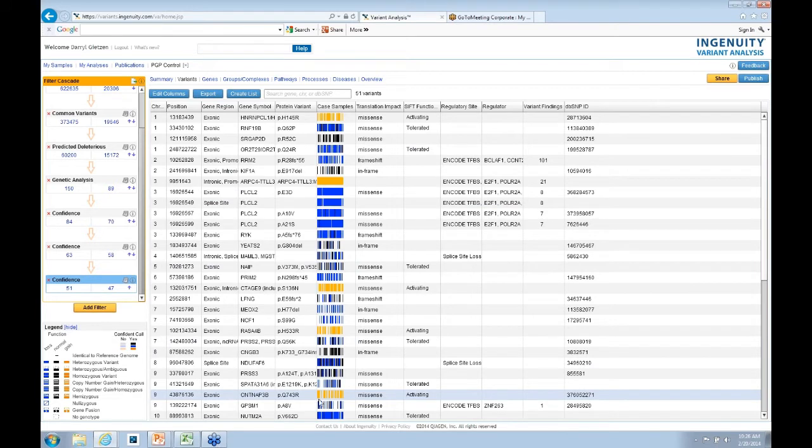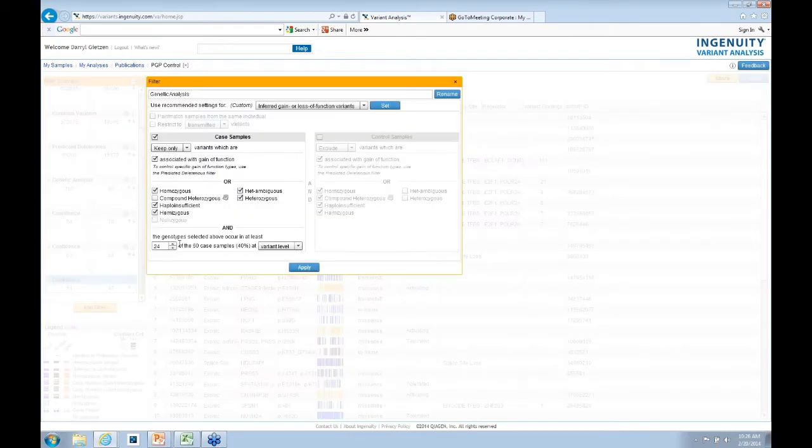You can take an analysis like this and run the analysis, and then come up to your genetic analysis filter and decide at what level, because these are going to be very platform specific, remember, right? Because we are basing our analysis off 1,000 genomes. So this is noise that's not appearing in the 1,000 genomes data, but it's appearing in the PGP data.